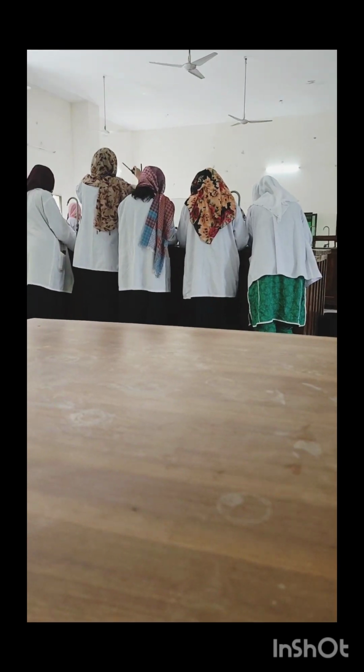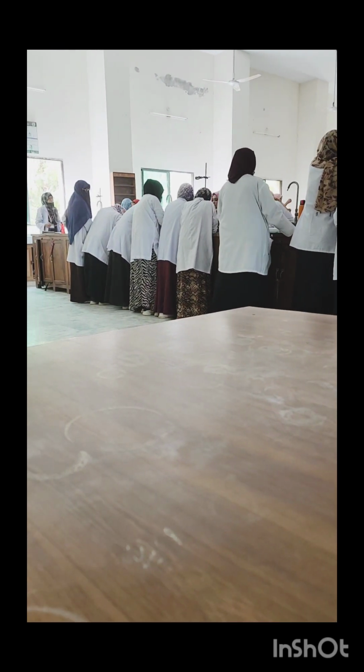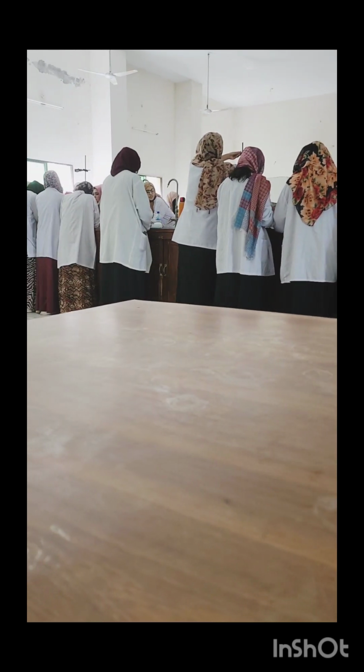These are my students. Now they are working, you can see them. This is the girls' side. They are now setting up the assembly. And this is the boys' side.